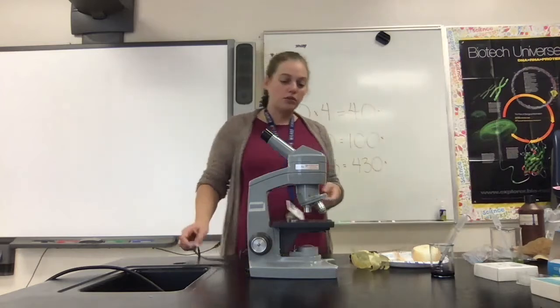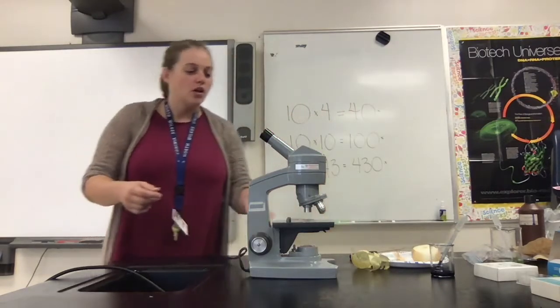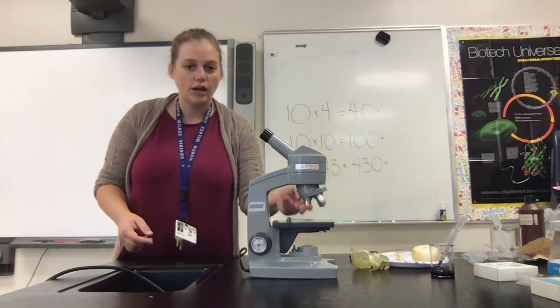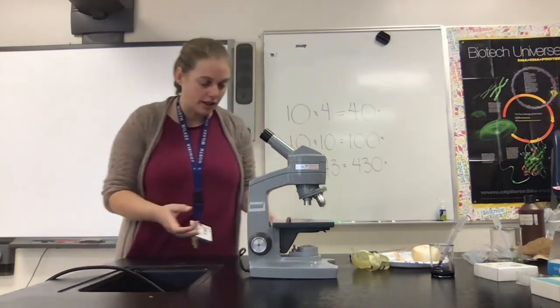When the microscope is plugged in, you have a light source here, and there's a switch to turn the light source on and off. When we need to focus on something, we're going to make sure that we have this lowest objective, and it is as far away from the stage as possible. So this is the stage. This is where you're going to put your specimen. We have stage clips, which will hold that slide down and make sure that it doesn't move too fast when you're trying to manipulate it.